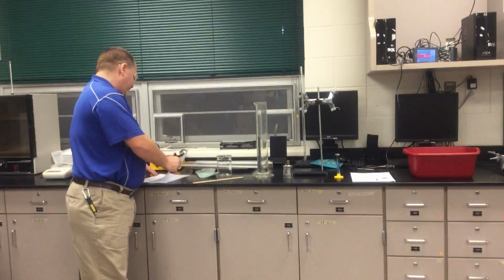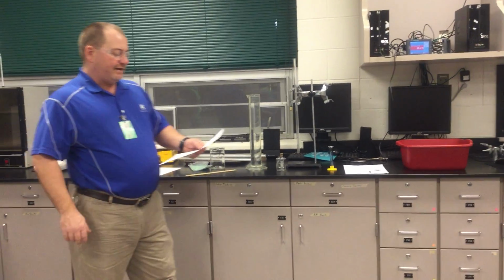For the 30.0 centimeter magnesium standard, 0.60 grams. Your water temperature in Celsius is 20.0 degrees Celsius. The length of your magnesium is 25 millimeters, and the volume of your gas collected is 48 milliliters. That is your trial 1.